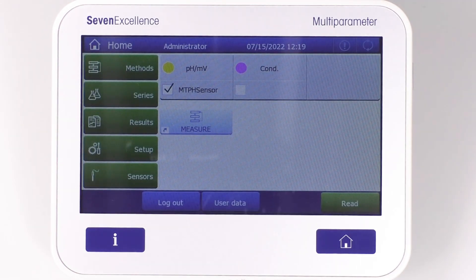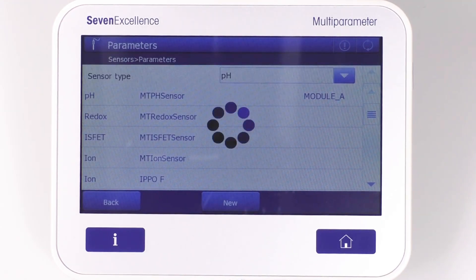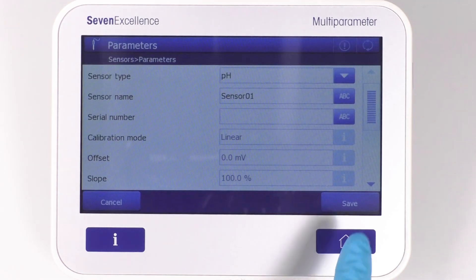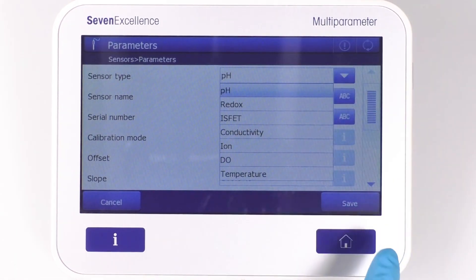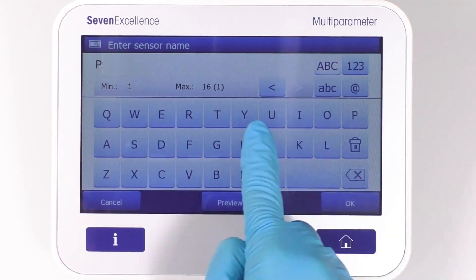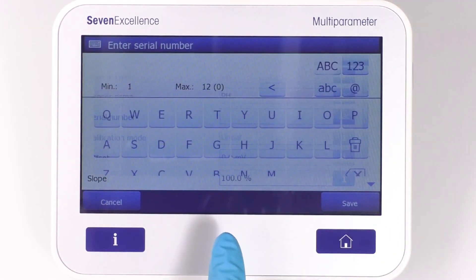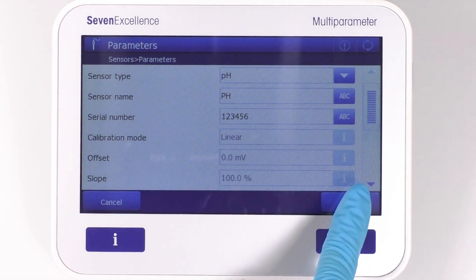First, you'll need to navigate to the sensors menu and press the New button. From there, you'll input and save the sensor parameters — name and serial number — and then press the Save button.